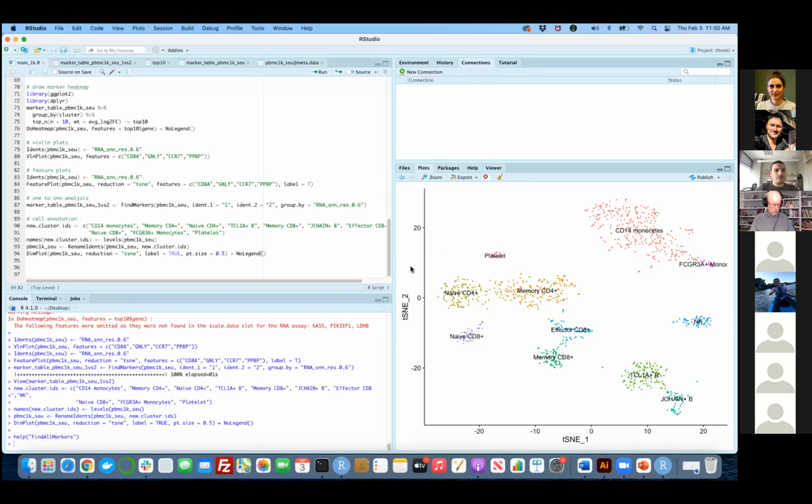What do you mean, do the single cell? For me, it's important to be able to cluster, grouping different types of keratinocytes, because we know that we have different types. I believe you're referring to the fact that you would FACS sort the keratinocytes from your sample, then do the single cell library prep? Yes. Okay, yes, I see. Yes, in some cases, if you are really interested in only keratinocytes, to achieve more sequencing depth, yes, that would be the correct way to do it.